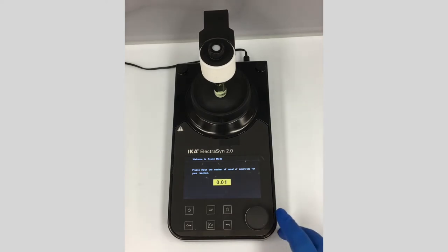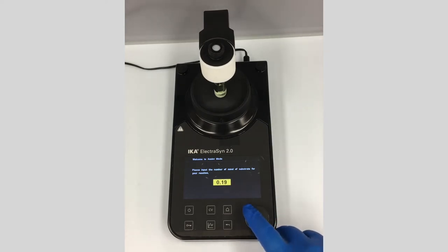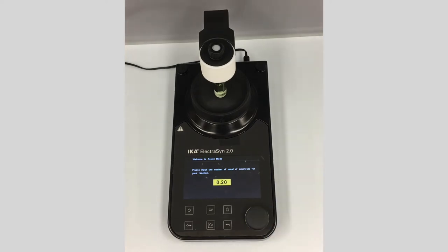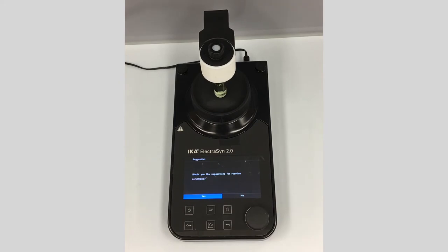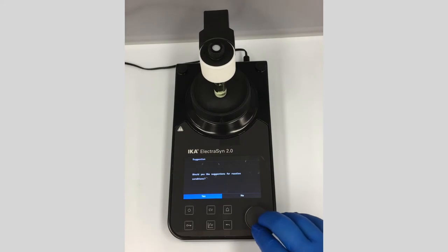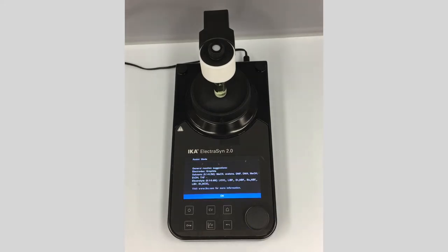Yu has been kind enough to mix this up for us. This reaction has 0.2 millimoles of substrate, so I'm going to input that and click OK. It then asks if you'd like suggestions for the reaction conditions — this is really to help out someone who's never run an electrochemical reaction before. Click yes for some basic suggestions and general guidelines.